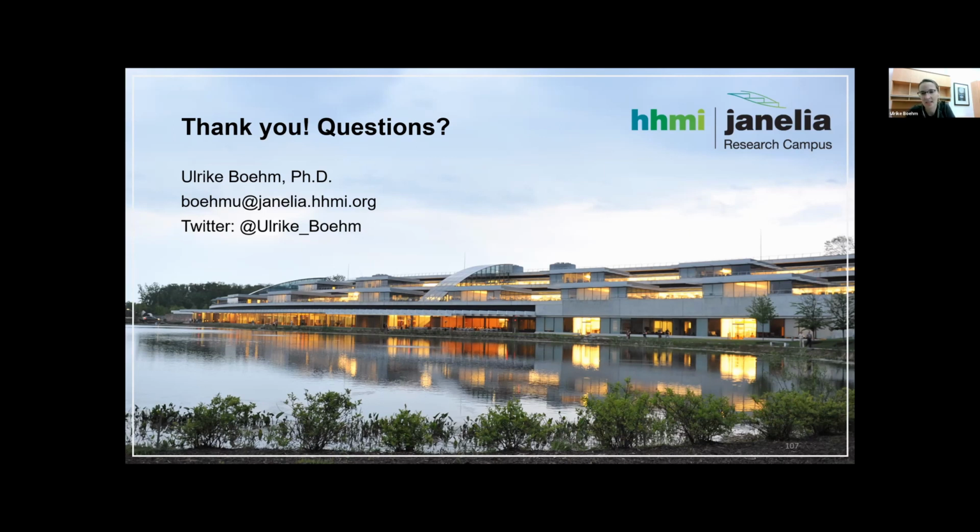Based on that experience, which is more than 10 years ago, by the way, my experience from that time was that the transfer is quite tricky. There were attempts in the past where one could marry a fluorescence microscope with an electron microscope, but these are not necessarily commercially available.